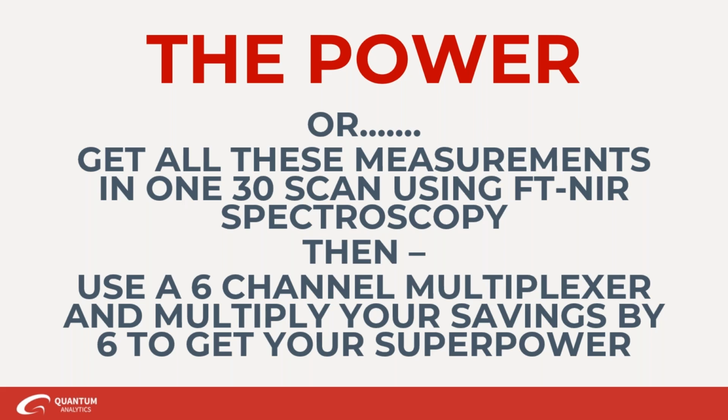Hardness in wheat is correlated directly to the particle size. You can not only use NIR for that, but it's actually a certified AACC method to be able to do that. So changes in particle size will absolutely, 100%, afford a change in your near-infrared spectra.